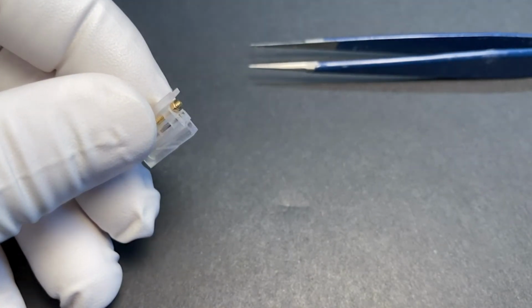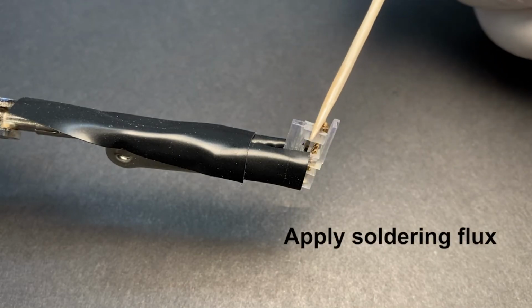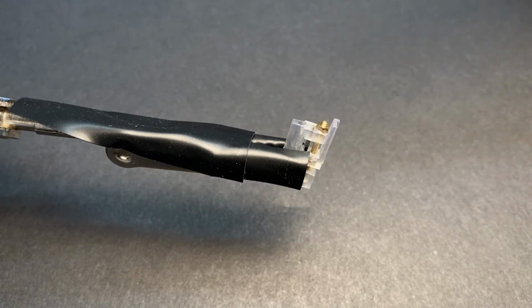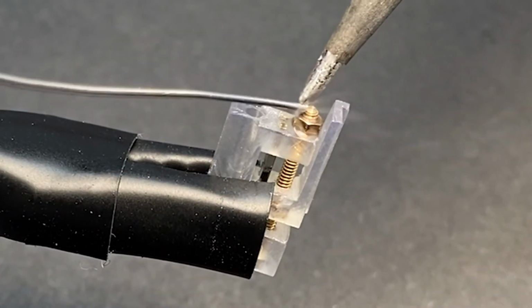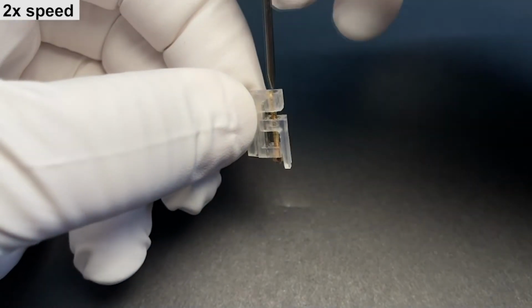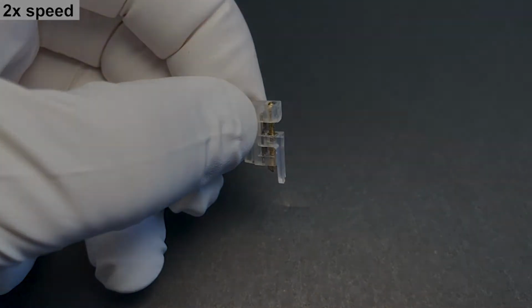And during soldering, first we apply a small amount of soldering flux. And then when you solder, you need to be really careful not to apply too much heat to the metal. So basically you just touch it and then remove, touch again, remove. Because if you apply a lot of heat to the metal, then that heat will spread through the metal to the plastic, and that can melt the plastic. And once this is done, you can test the movement of your drive. If it's good, you keep it. If it's not, then you need to start over the assembly.